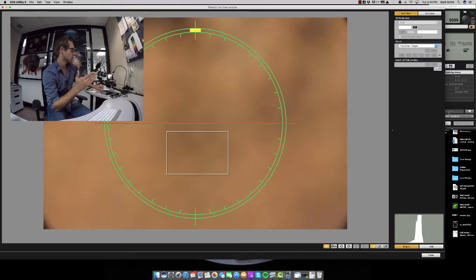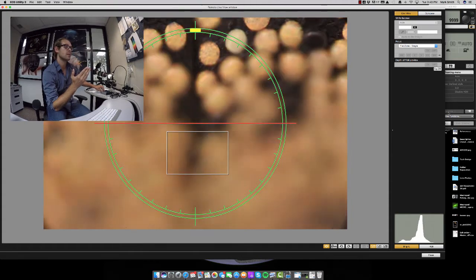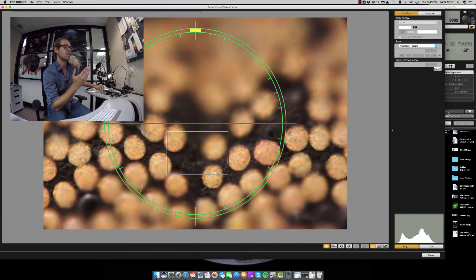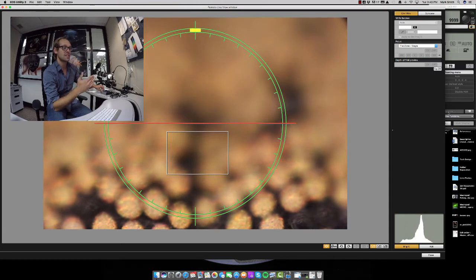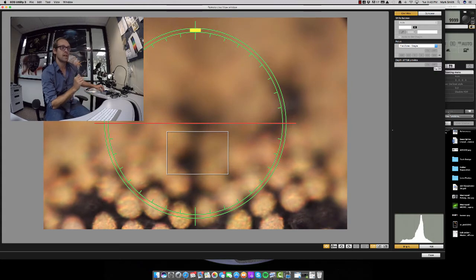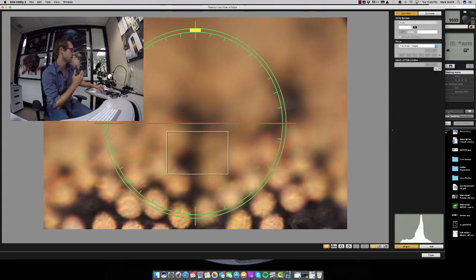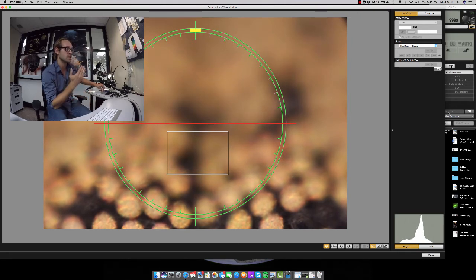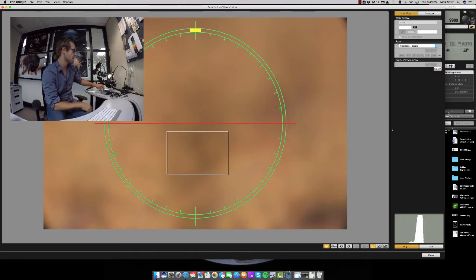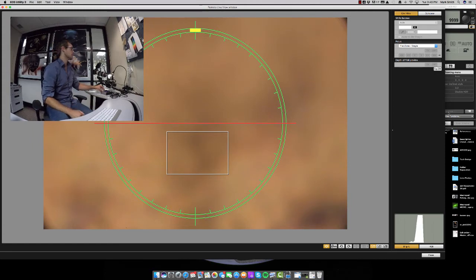You don't want anything in focus, but you just want to make sure that the focal plane is behind the area you're going to be shooting. Now we're going to push the beetle back, so we're going to move the focal plane through the specimen so that now we're focused towards the front. We don't want to stop there. You can see that we're almost out of focus, but given the room we need to allow for any wiggle or any loose ends associated with the servo, we would just want to overshoot that mark until everything is out of focus. It's okay to overshoot it in the end.